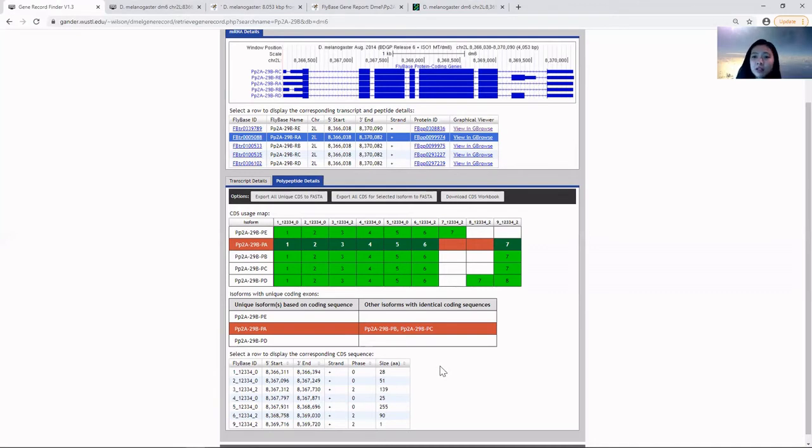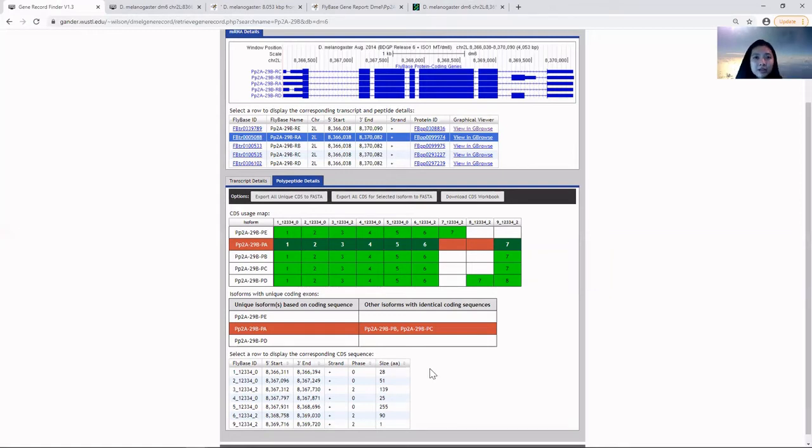Student annotators have to annotate it in their target species.